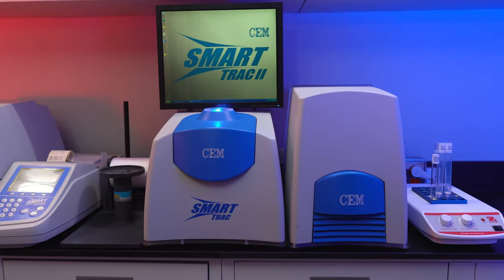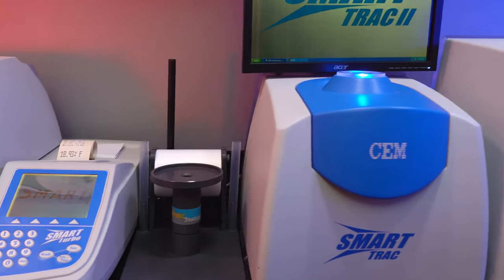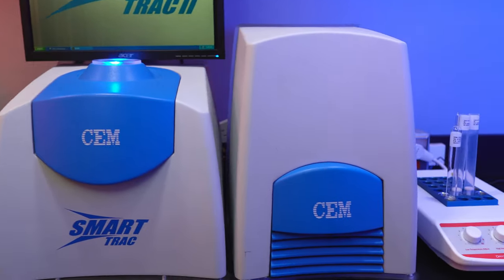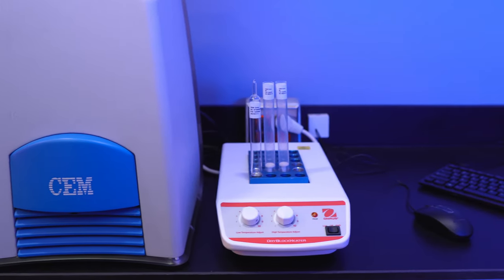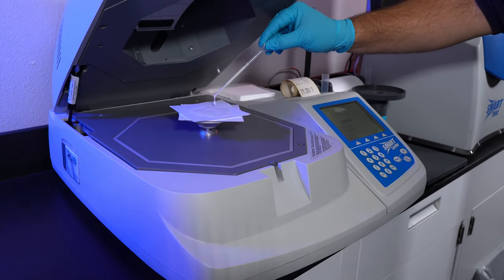The SmartTrack 2 consists of five components: the SmartTurbo, the SmartTrack Station, the SmartTrack Magnet, the SmartTrack Processor, and a dry block heater. The SmartTurbo is used to remove all the moisture from your test sample.